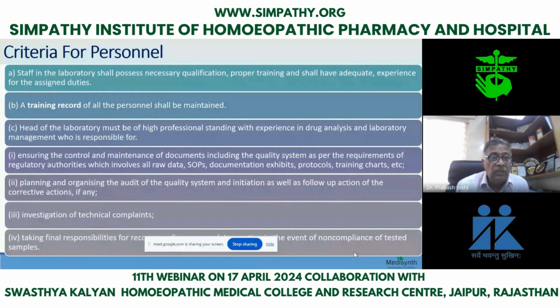Then criteria for personnel. Staff in the laboratory shall possess the necessary qualifications, as I told you earlier. A training record. Now, you all know that training is very important. Why so? Because every time you get new instruments and new parameters. If you see the pharmacopoeia, in 1971 the first pharmacopoeia came. In that, the testing was only macroscopic and microscopic. After the fifth volume, they mentioned the percentage of alcohol and total solids. Then after 1995, they mentioned TLC, UV analysis, something like that. So training is required to update the knowledge.